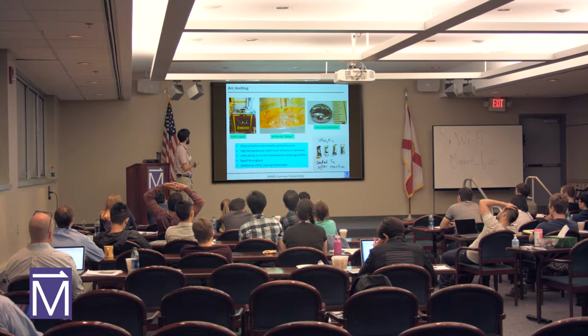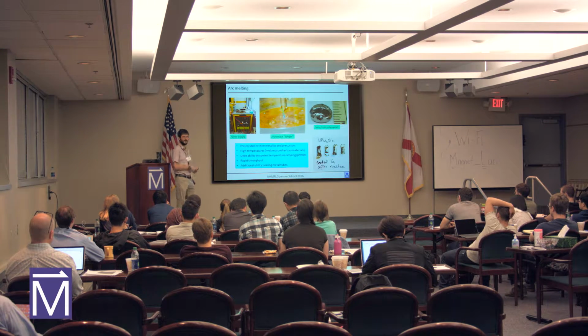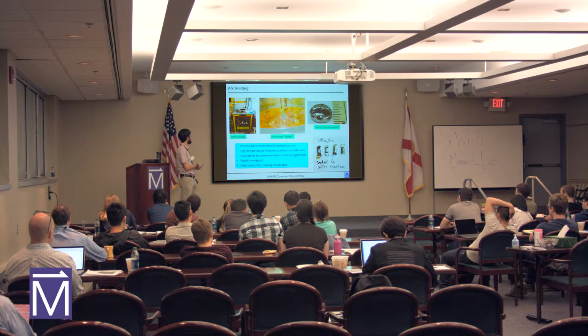Then you'll refill with argon, and what you can do, so this is just an extended welding tip from a power supply. And what we do is that we just drive basically lightning through the sample. And if you do that, you can melt almost anything if electrons will flow in it. So it's pretty fantastic. I mean, you guys should see this sometime. If you put the lightning through here, you can get up to something like 4,000 degrees C. So it means you can even melt refractory materials.